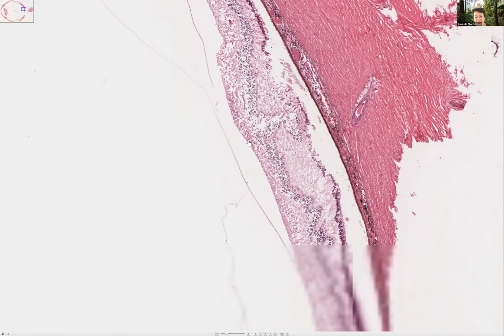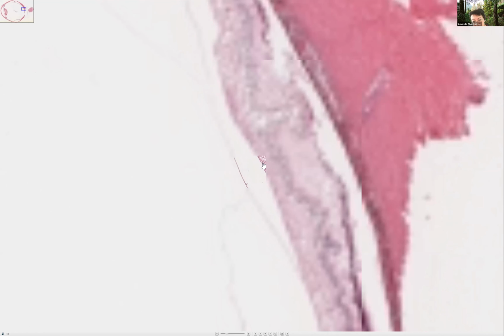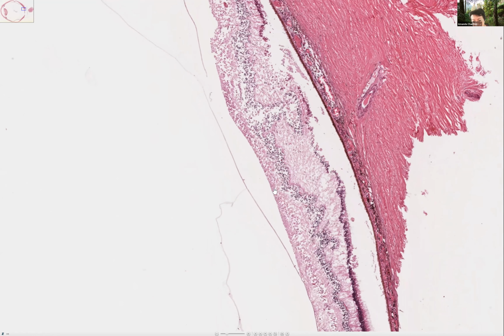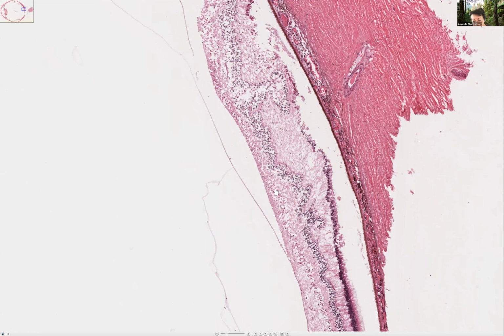So the ganglion cells, although some of them are present, there seem to be apoptosis or fading away. They become very eosinophilic looking. Then this nerve fiber layer has become very fluffy and rather degenerate looking. There's disruption of the inner nuclear layer and outer, what's that called?